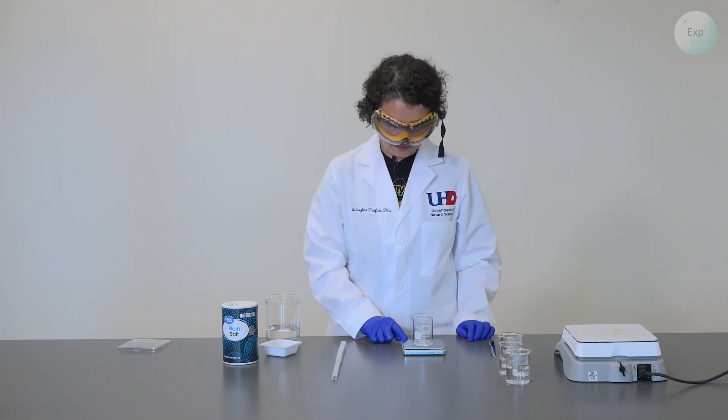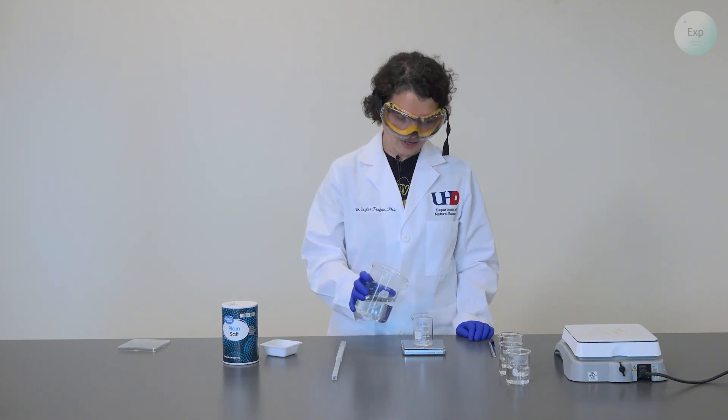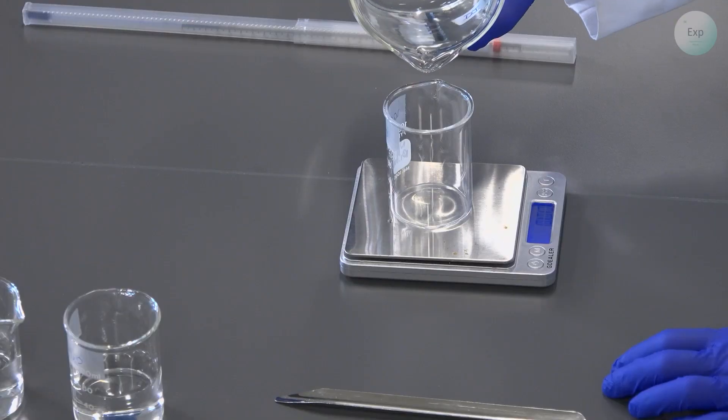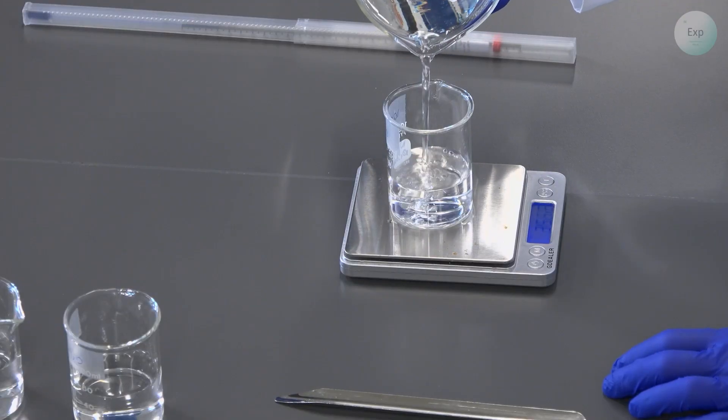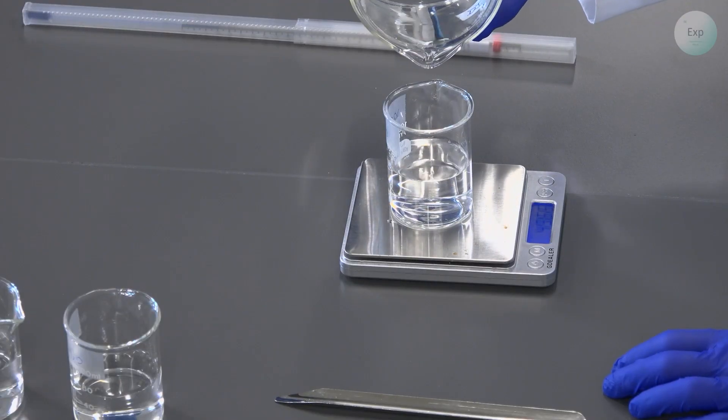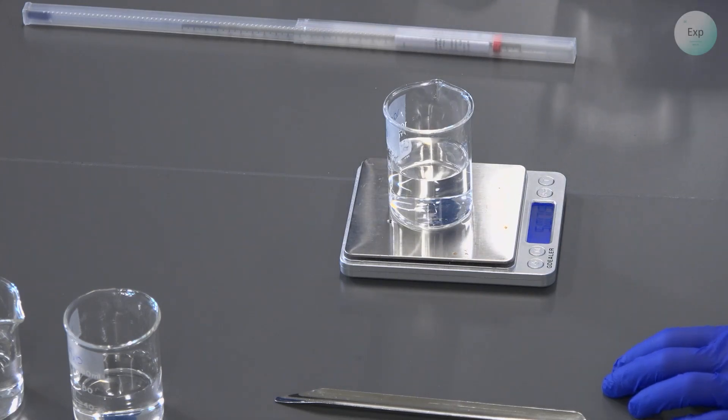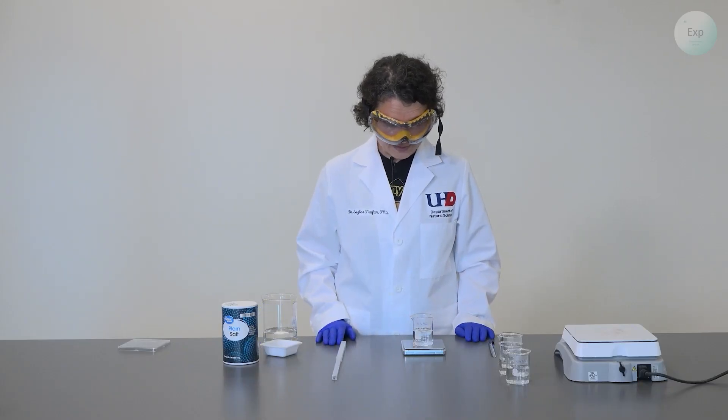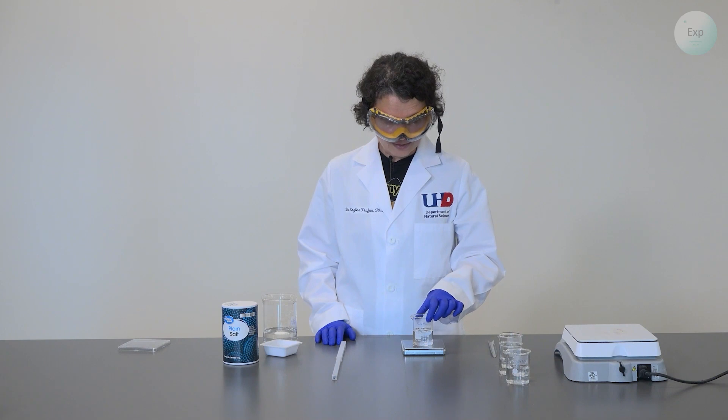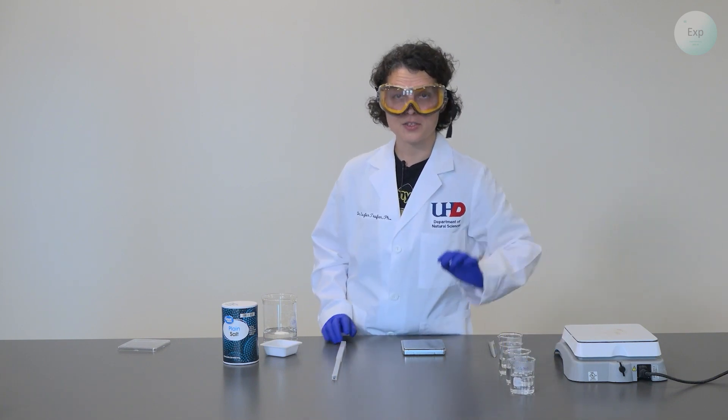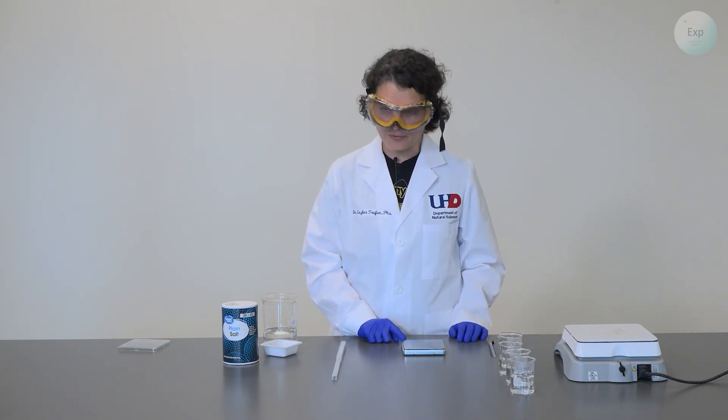I will place my final beaker on the scale, tare it, and then transfer 50 grams of water to it. This is just a little bit over at 50.79 grams. This one will eventually have 10 grams of sodium chloride added, hence the final label.